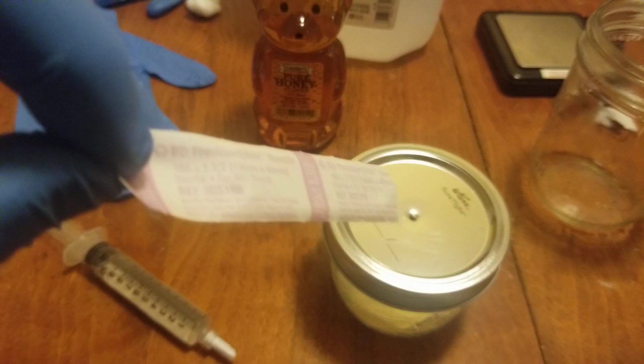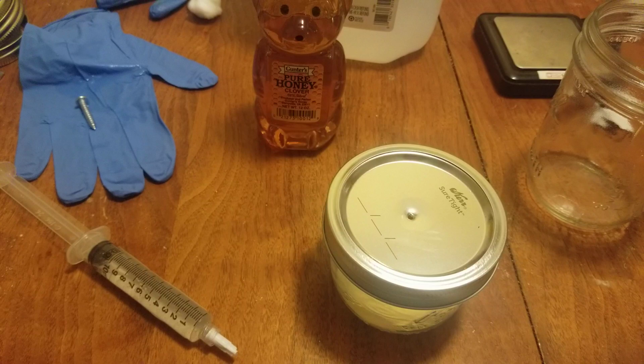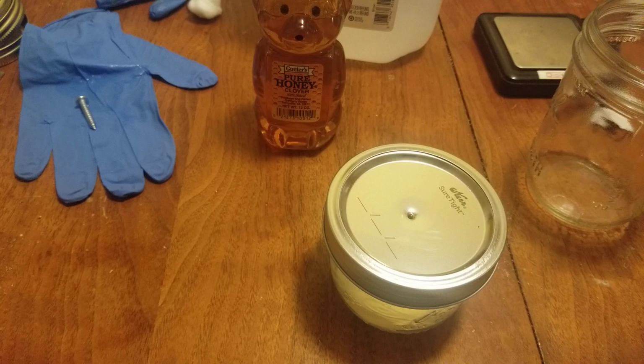So you might be asking yourself, how many cc's do I use of this? And the general answer for that is about four. About four will generally get you what you need. This didn't go on very straight. Well, it'll have to do. We're going to use about 4 cc's of this.